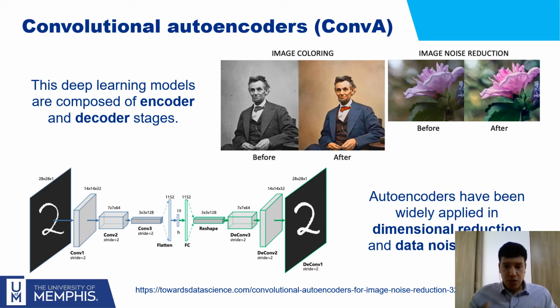Well, these algorithms are based on the strategic idea of encoding and decoding information. As we can see on the left bottom part of the slide, what we are doing in this model is to input an image in a convolutional autoencoder in which step by step, or in each stage, the information of the input image is processed, somehow abstracting the main details.